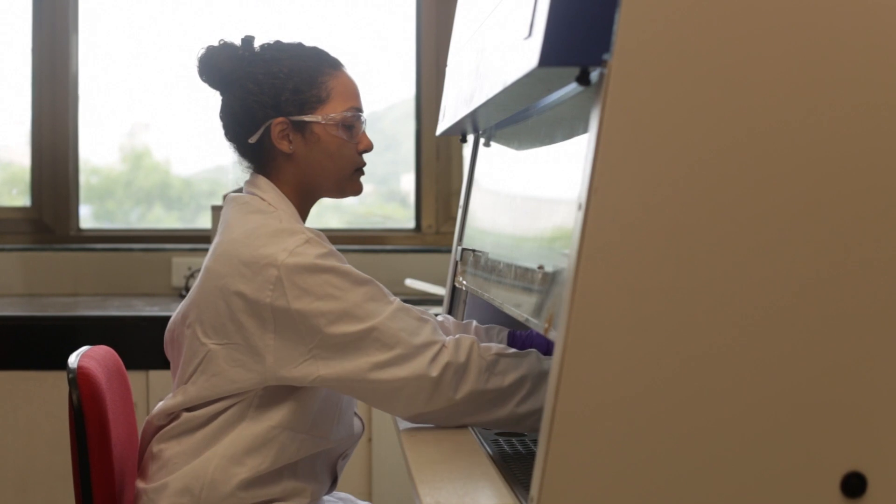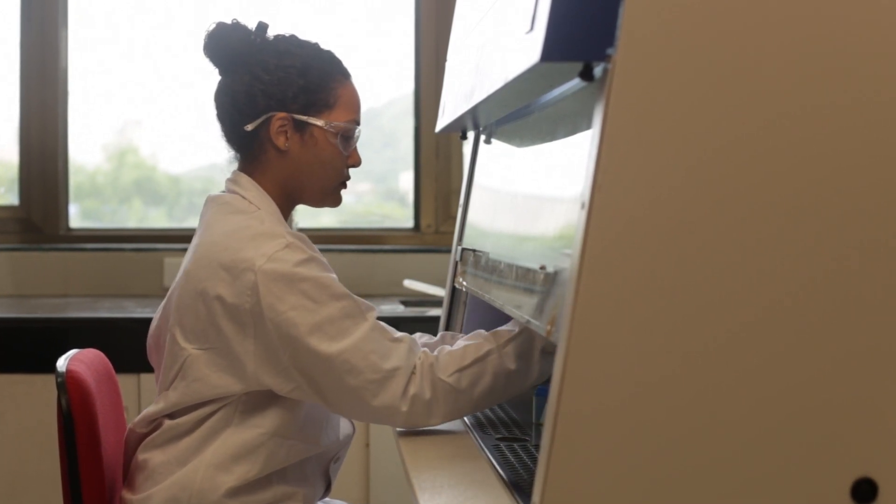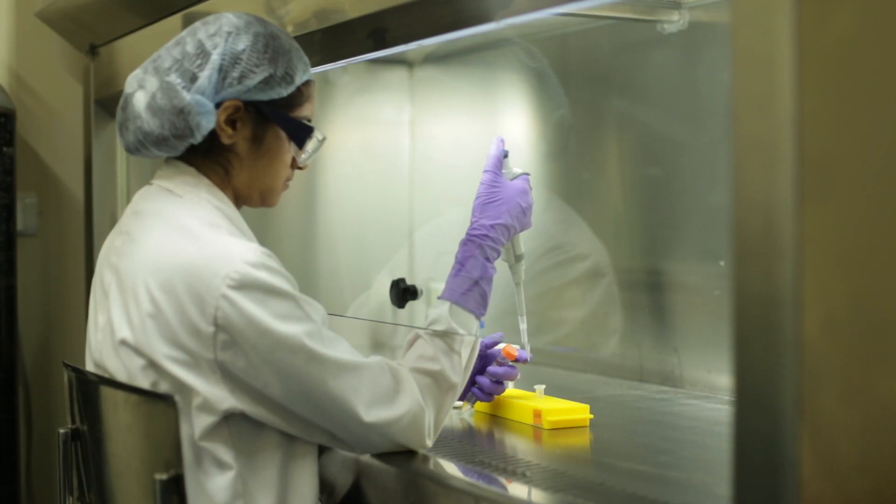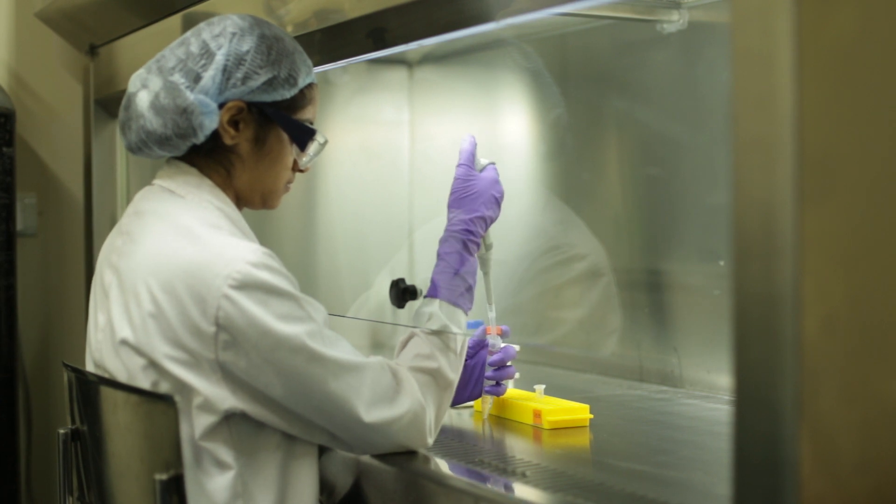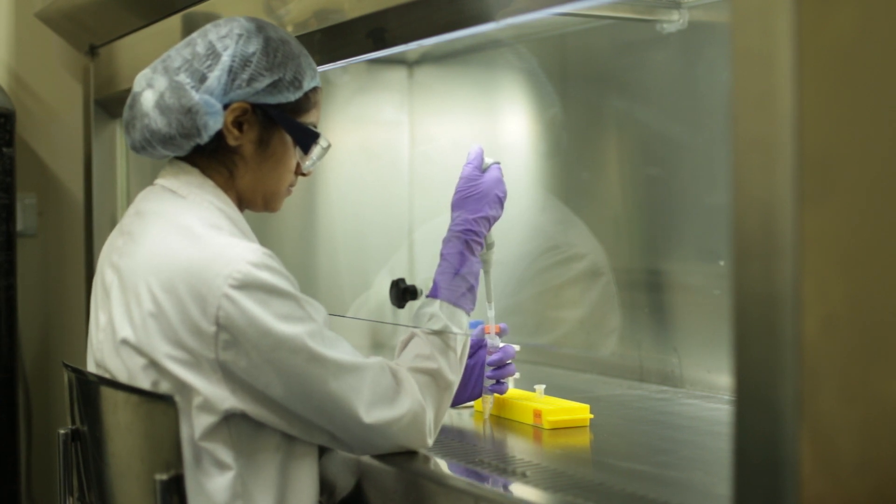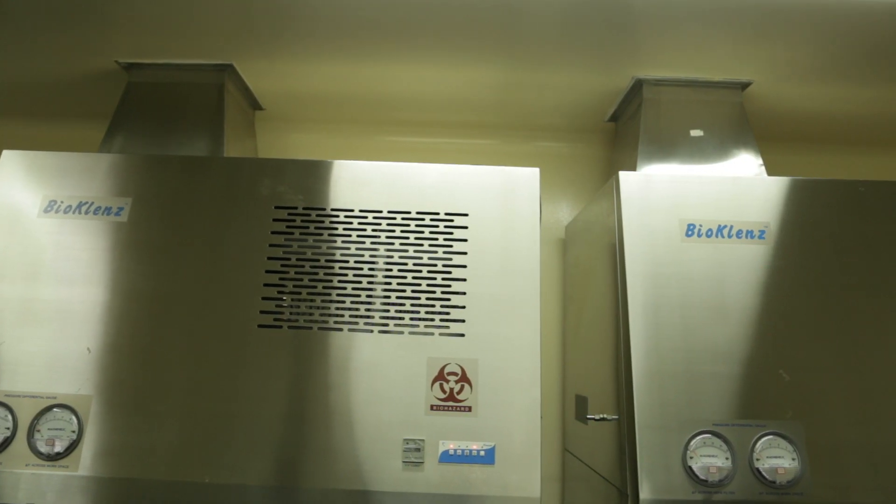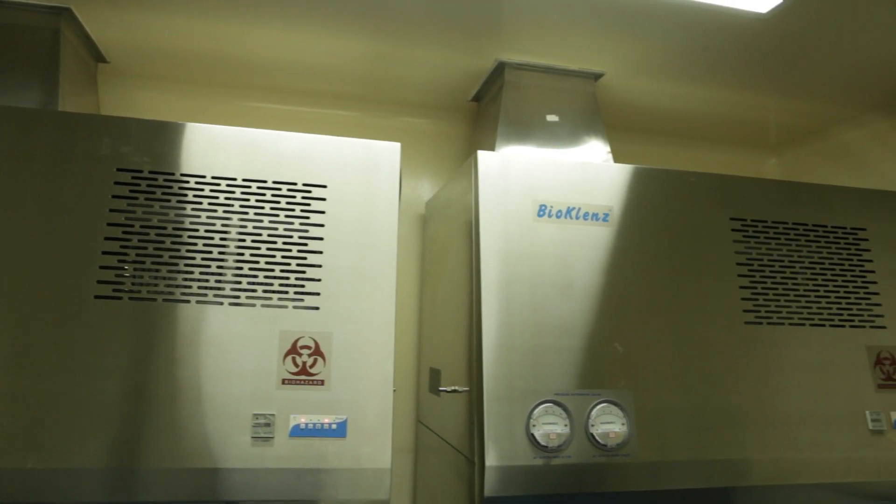Biosafety level 2 facility is used for work with agents that pose a moderate health hazard. The work is done inside a biosafety cabinet and entry to the area is restricted.